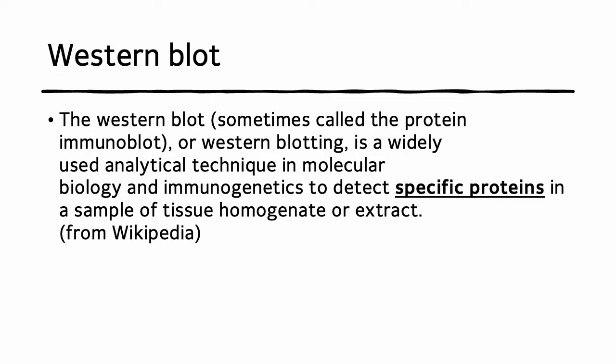However, there are various cases, but what's important is that in Western blot, you can detect specific proteins with the help of antibody. And you can actually compare the amount of protein with Western blot.